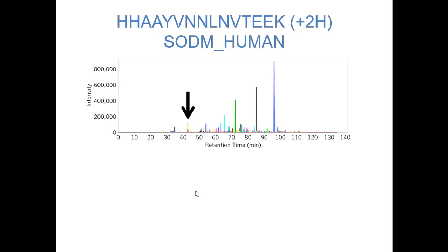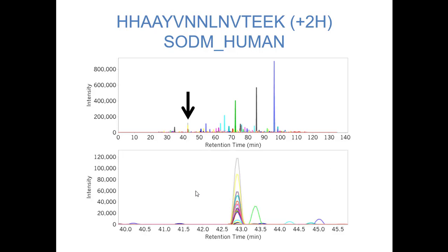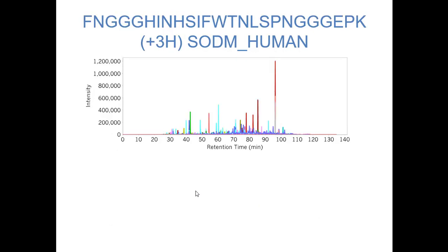But that's basically where the peptide is. If we look at the trace of it, it has a nice shape. It looks like a reasonable peptide with lots of different fragment ions that we can call, and it stands out from the baseline. So this is an example of what good DIA data looks like. It basically looks like good PRM data.